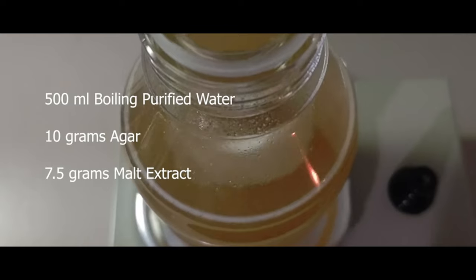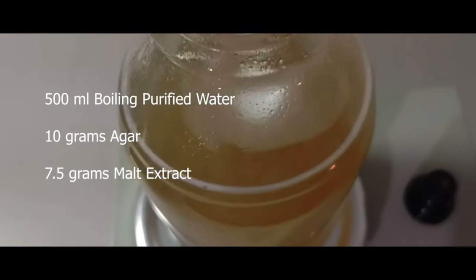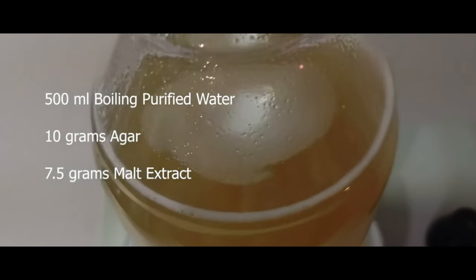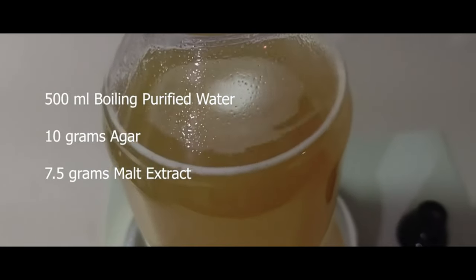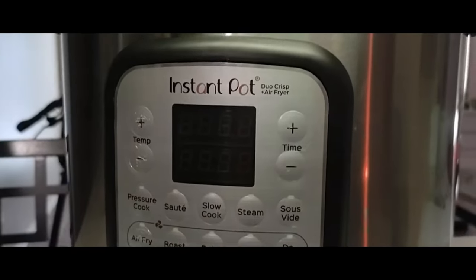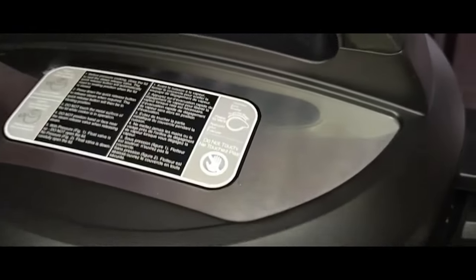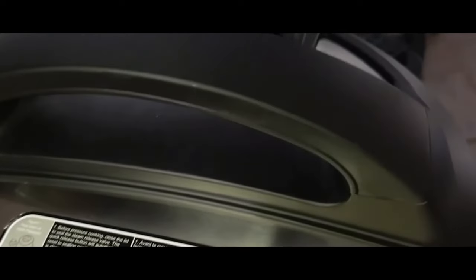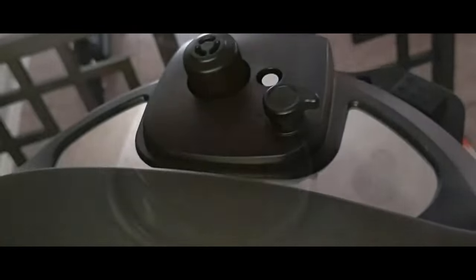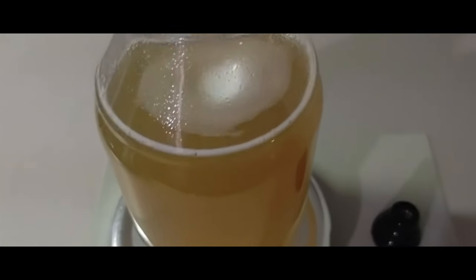Using 500 milliliters of boiling purified or distilled water, mix 10 grams of agar and 7.5 grams of malt extract. Pressure cook for no longer than 20 minutes at 15 psi so you don't caramelize the sugars or overcook the nutrients. Allow the MEA to cool between 120 and 140 degrees then you're ready to pour.